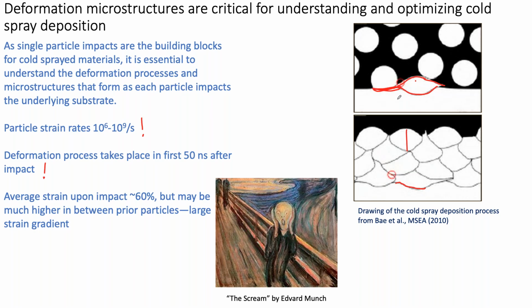Here's an interesting question. What do you think is happening in that first 50 nanoseconds, that instantaneous part of this? Could the recrystallization be happening then? Is it happening after the impact, since the heat dissipation probably isn't instantaneous? Could it be some stored deformation that would create that?